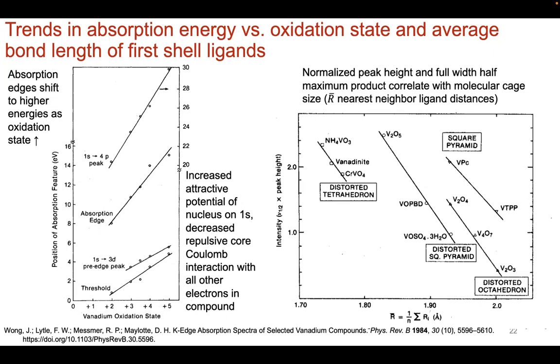So it's just hybridization that's allowing that to happen. And more hybridization as you're oxidizing, yes, because you're now also overlapping with the 2p of the oxygen.